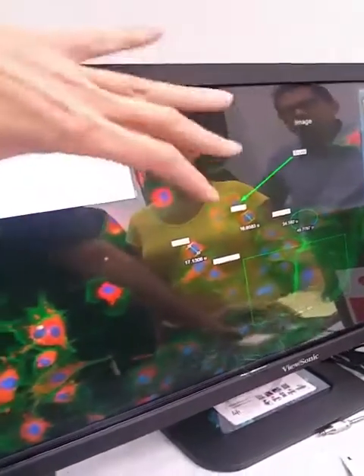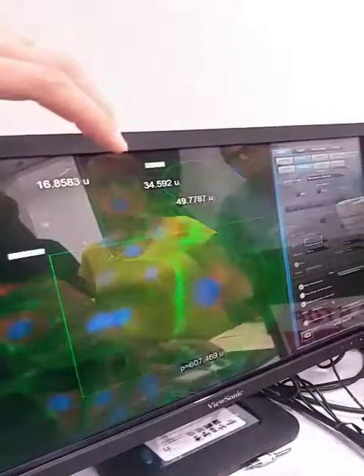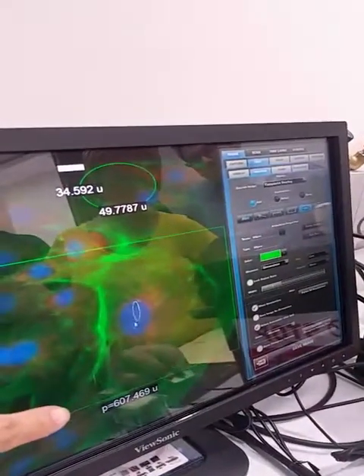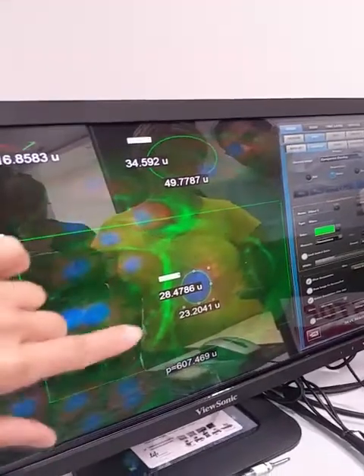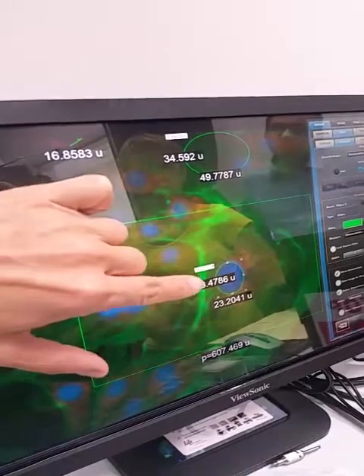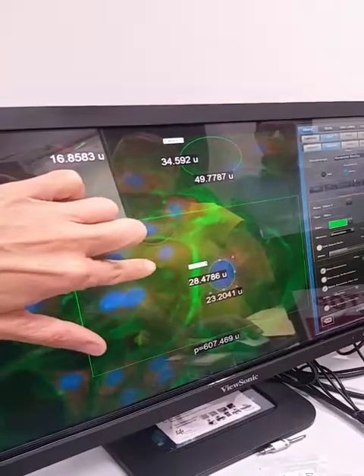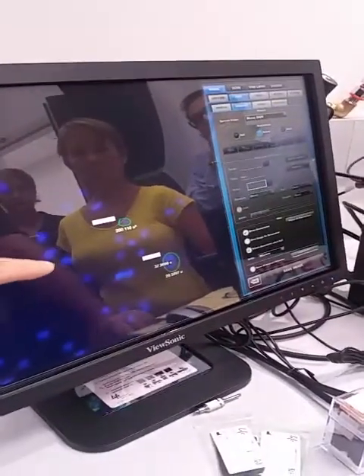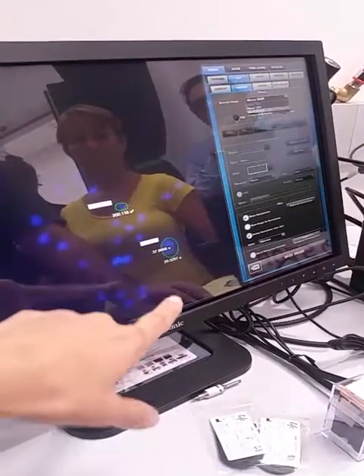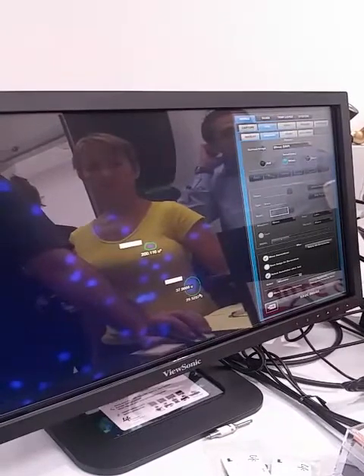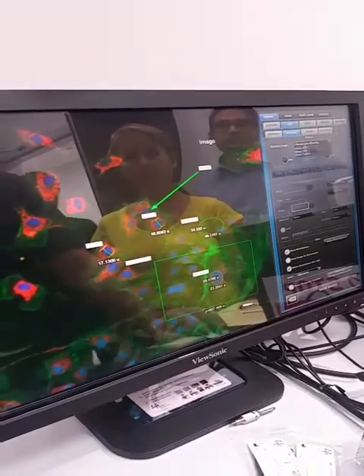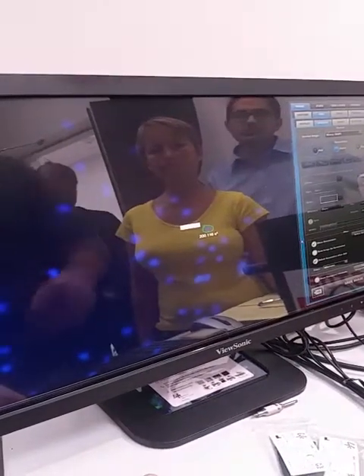Let's zoom in and draw around the nucleus of this large cell — you can use circle or free trace. If we turn off the green and blue channels, the drawing stays in the overlay, but if you go to an individual channel like DAPI, you have to remake the drawing. You'll see it changes position between channels. So for each individual channel, you have to create your own area separately.